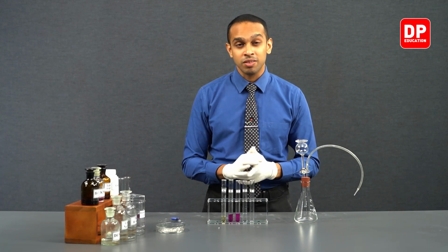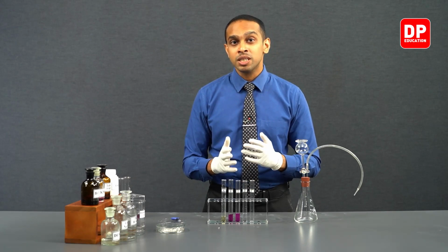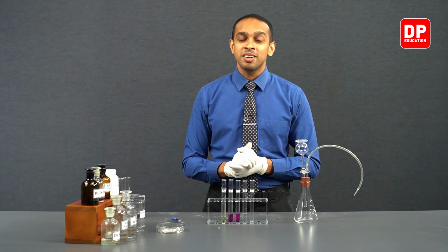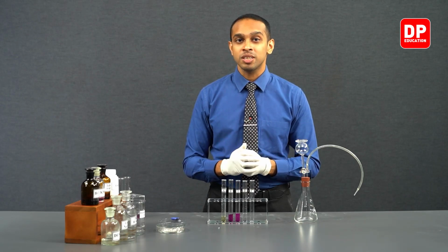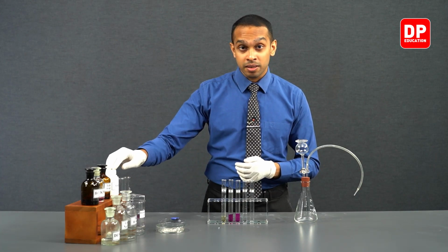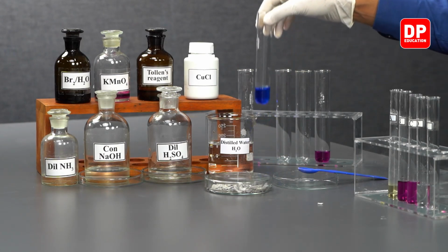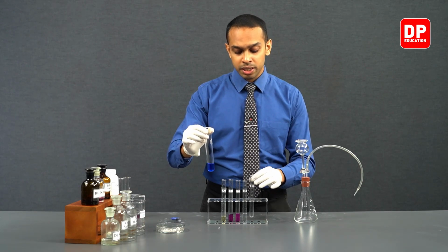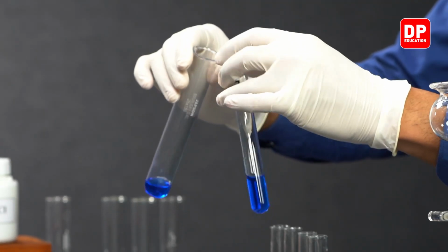So in the presence of silver 1 plus ions here, when you are reacting ethyne which contains terminal hydrogens, it will produce a white color precipitate. When it comes to ammoniacal cuprous chloride, we have an ammoniacal cuprous chloride solution here. Now in test tube E, we should have an ammoniacal cuprous chloride solution.